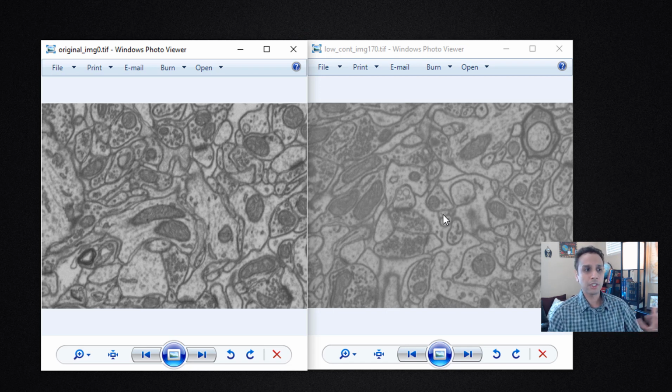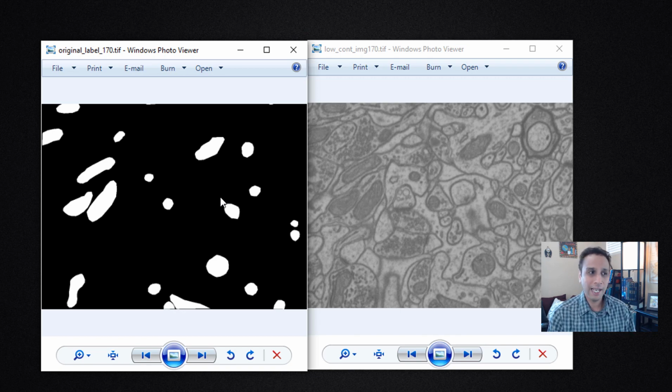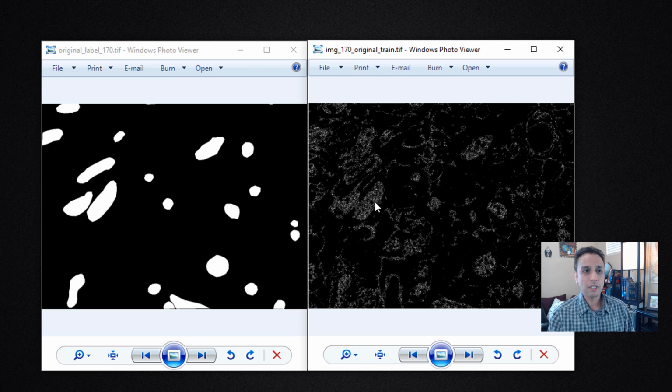Well, the best thing to do is take the old model, apply it, and see if it's working. So for example, if you see something like this, wow, that's amazing, it's working, but that's not the segmentation result. That's the ground truth, actually. The segmentation result is this, extremely horrible. So in this case, I know that I have to retrain this, because my model was working fine on original images, right? So I know I have to retrain this.